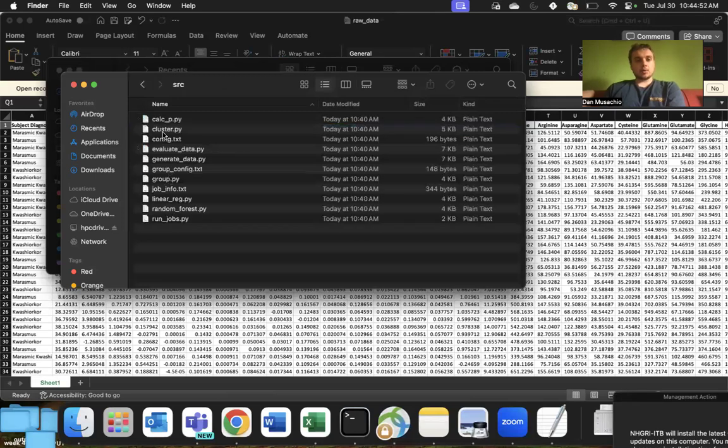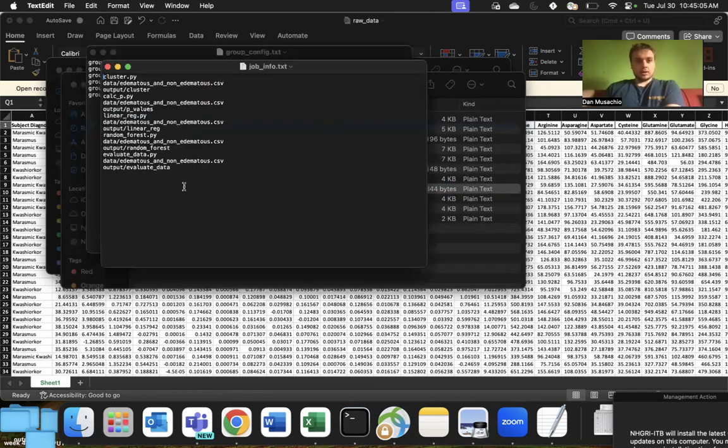And finally, we're gonna want to do a source, go to here, and then to the run job info.txt. Gonna open that. And so basically you write the name of the program. Here are the 5 programs that are currently offered, and you can open them to see a more thorough description of what they do.